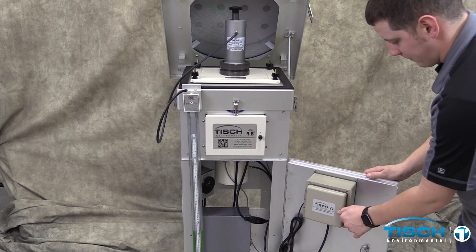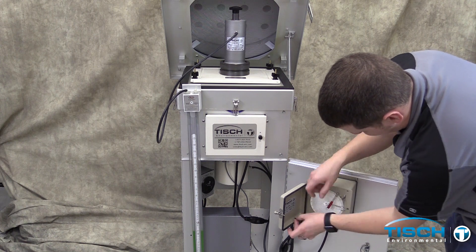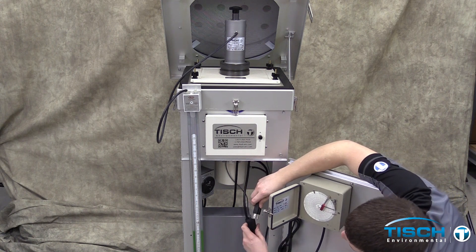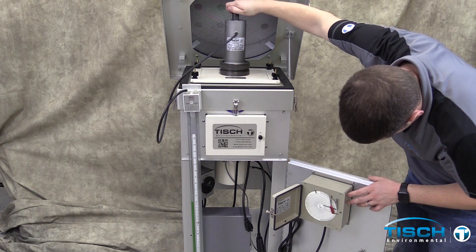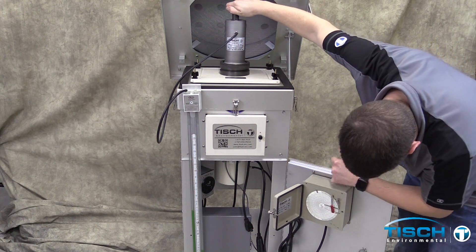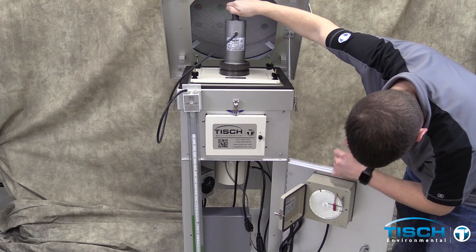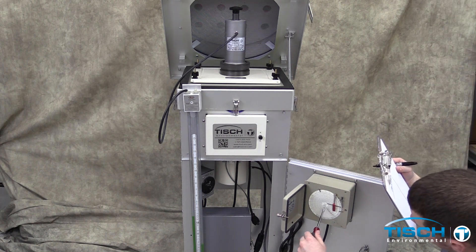Open the TE5009 flow recorder and remove the black pen cap. Unplug the motor from the flow controller and plug the motor directly into line power. Turn the knob on the calibrator clockwise so that the chart on the recorder reads 50 CFM. You may have to knock on the recorder so the pen moves freely on the chart.